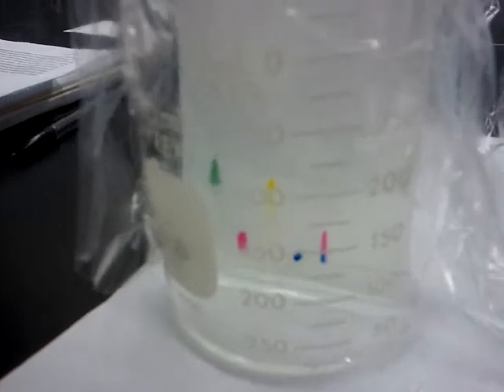So what's making it different here is the different affinities and different polarity of the different components in the dyes, and they're either choosing the card or they're choosing the solvent. And that's basically what we have going on today.